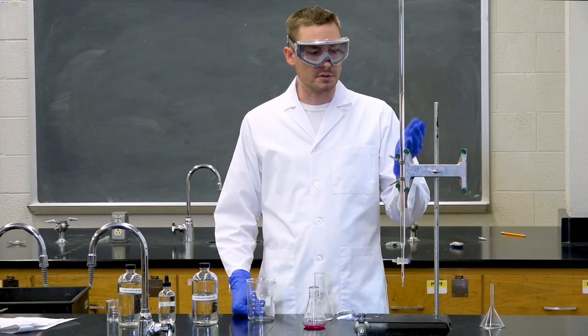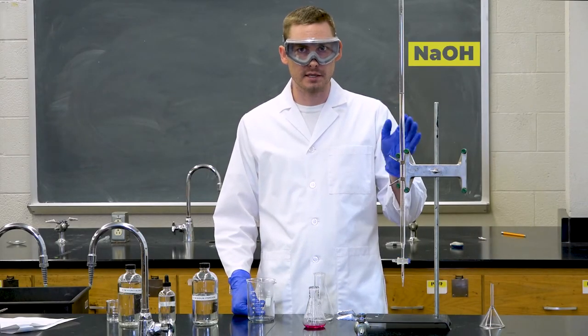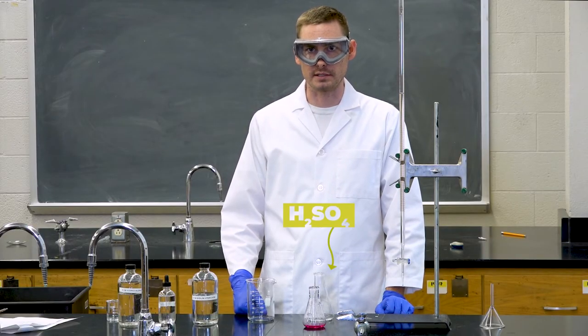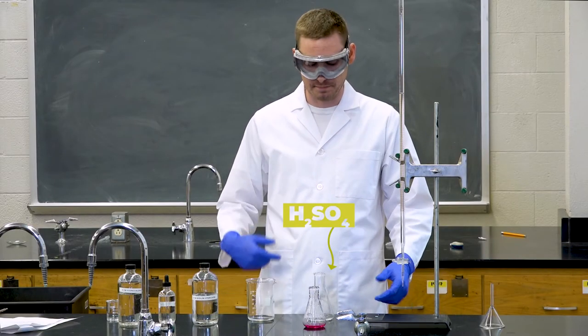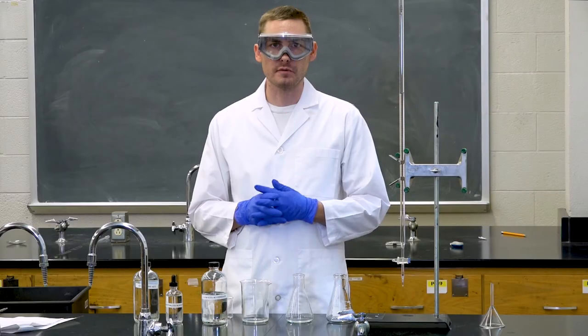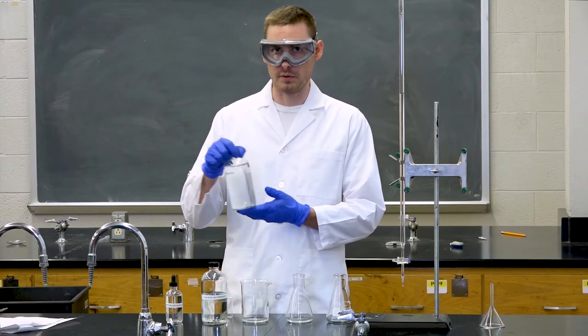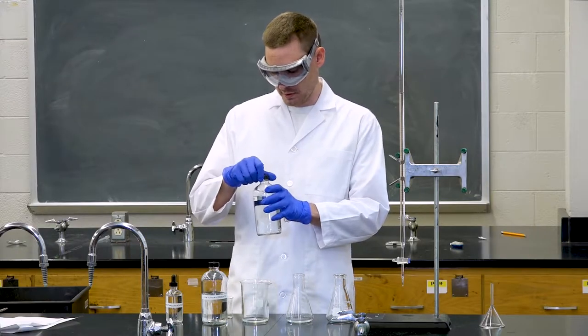The next experiment will be using sodium hydroxide as the base again in the burette, but this time we're going to be titrating into a solution of sulfuric acid. So let's prepare that now. Before we begin, we need to rinse our volumetric pipette again, but this time with 0.1 molar sulfuric acid.